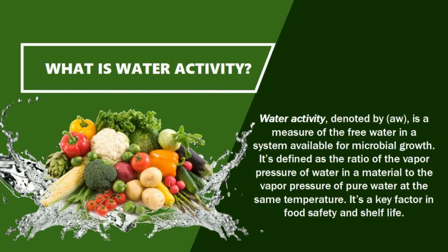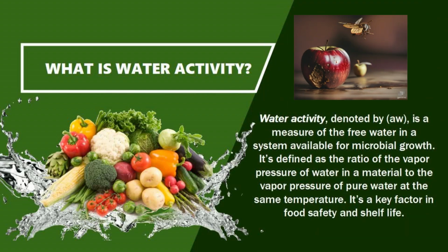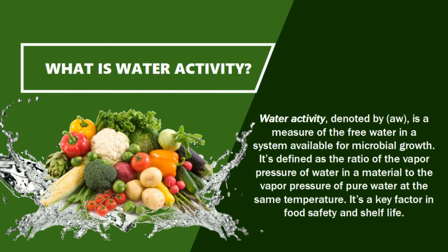It means water activity is like a water score for food. It measures how much water is available in the food for bacteria to use. The higher the score, the more bacteria can grow, which can make the food spoil faster. So it helps us understand how long the food might last before it spoils.